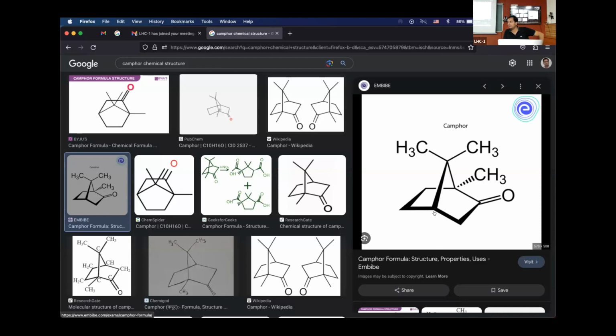This molecule was chosen so that you have all types of carbons. You have carbons with no protons, carbon with 1 proton, carbons with 2 protons, and carbon with 3 protons. From the basic idea of chemistry, I'm sure you would understand the methylene protons, the CH2 present here. Unlike the case of ethanol, where the methylene protons were chemically equivalent, in this case they are not chemically equivalent because there are chiral centers present. There's a chiral center right here. And also the entire molecule does not have any axis of symmetry, making the protons of the methylene groups unique.